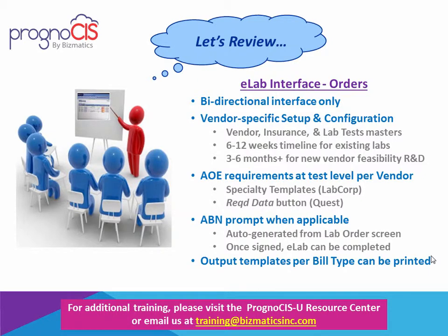And finally, even though eLab goes electronically directly from EMR to the vendor, you do still have the ability of printing out a physical requisition based on bill type.